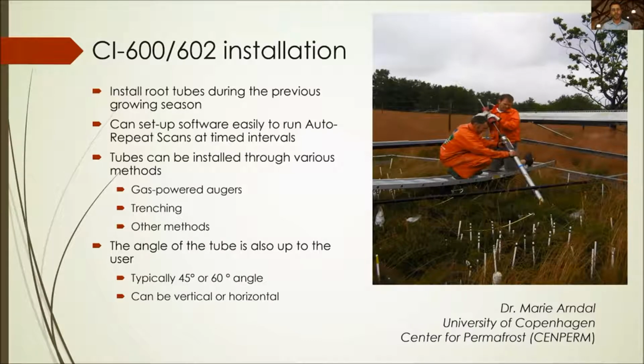But the more important thing when you're installing these is that you want to keep the environment in the soil around the tube as similar as possible. That means not allowing UV light in, not allowing moisture in that is atypical to what you would typically find in that area of soil, as well as any other temperature and environmental effects. When we sell these tubes individually, and when we give you the six with the instrument, we actually have installation caps, and we give you the ability to buy a gas-powered auger to install these.